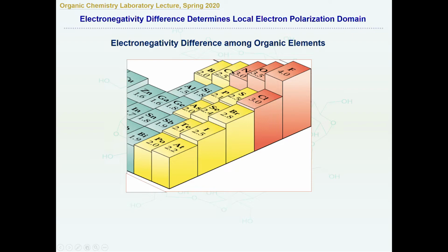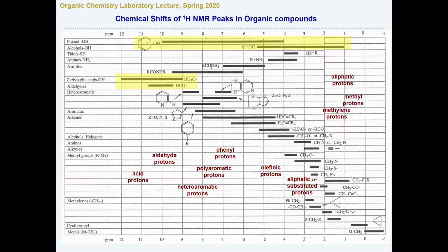So the electron is going to pull toward that, and that will draw the electron density around this proton lower, and the effect will be a shift, the chemical shift, in some way. So what do we see in general? How do you recognize and use the NMR?